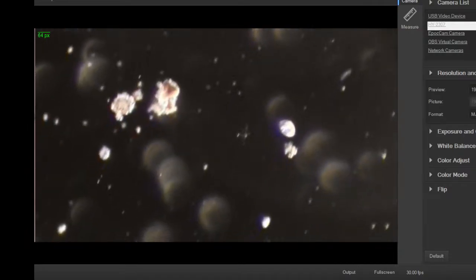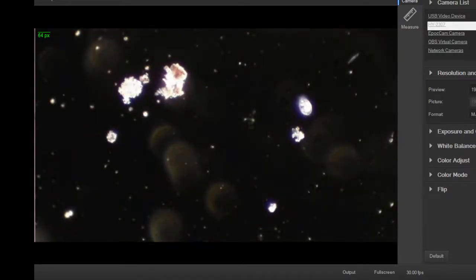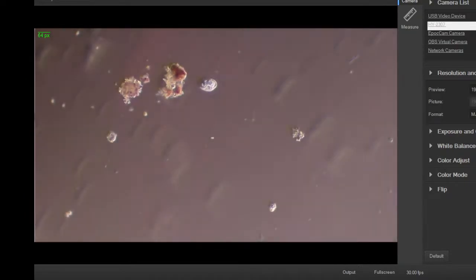Little guys in the background there. Having better luck, I think, with the oblique lighting. Okay, a little more oblique. That's even better there. There we go. And one of these nights, I'm going to put my phase contrast optics in. It's a really nice view of these guys in phase contrast.